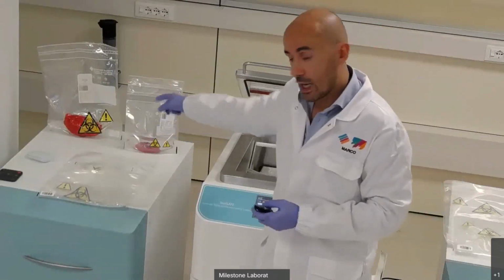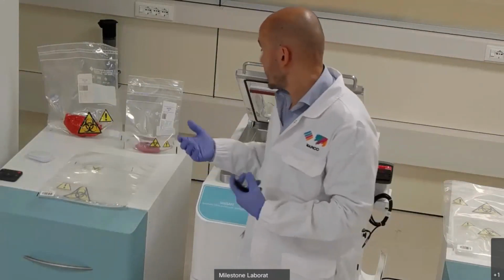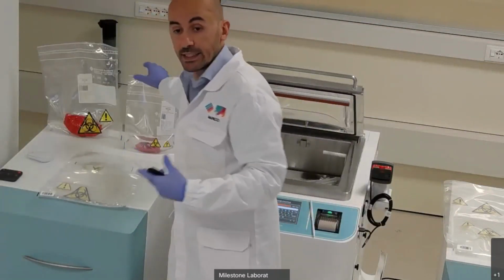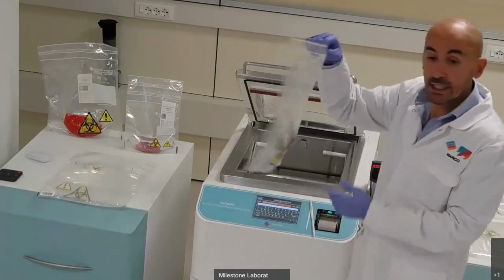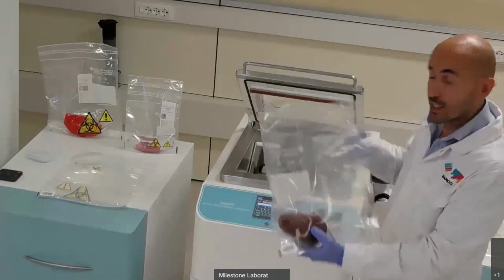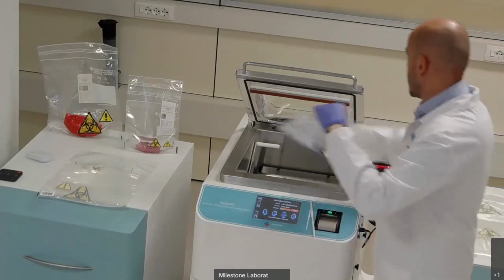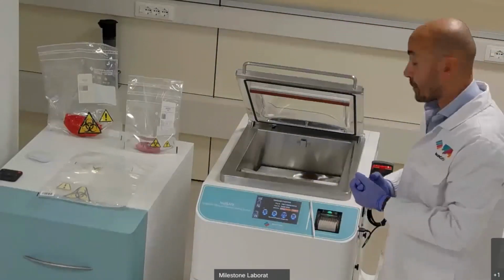Since we are dealing with fluids, I want to mention the other two bags available here, the so-called self-standing bags. The name is self-explanatory: they are bags designed to stand up vertically, even if they have specimen and fluid inside. Also in this case, I have a sample already ready in the cavity. In order to start the procedure, I just need to scan the identification code of the bag, the identification of the patient, and place it in the cavity. I have these magnets which add further stability to the bag.